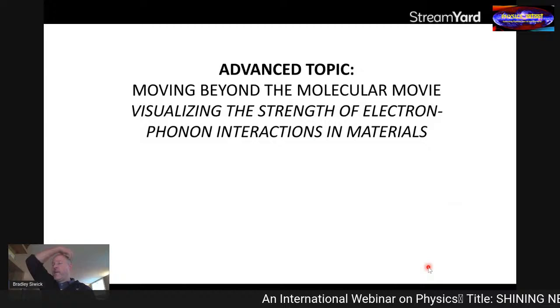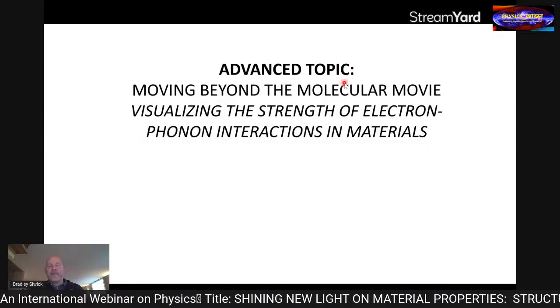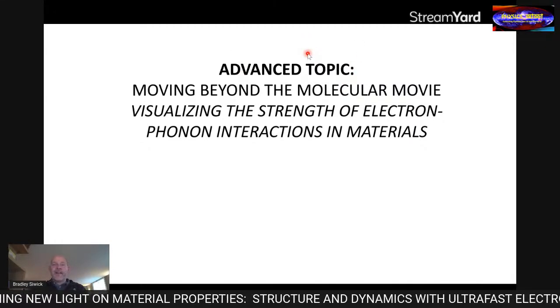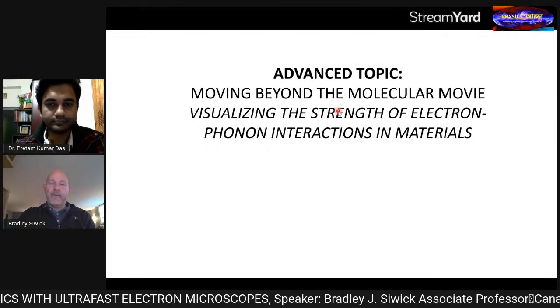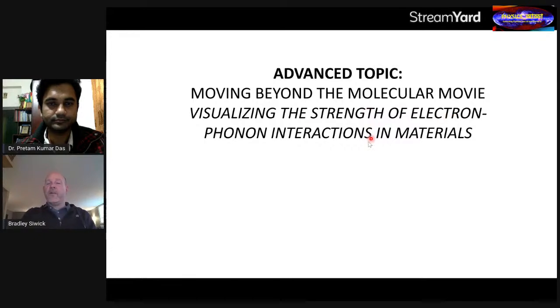So I've used up my time. I'm going to have to go right to the end. I had intended to discuss a bit of an advanced topic. This is quite challenging, and maybe it's best that I don't go through it. I'll just say we've moved beyond molecular movies in my lab, directly to being able to visualize the strength of electron-phonon interactions in materials, to be able to use these electron scattering techniques to directly interrogate how strong the interaction is between the electric charge carriers in the material and the lattice vibrations.